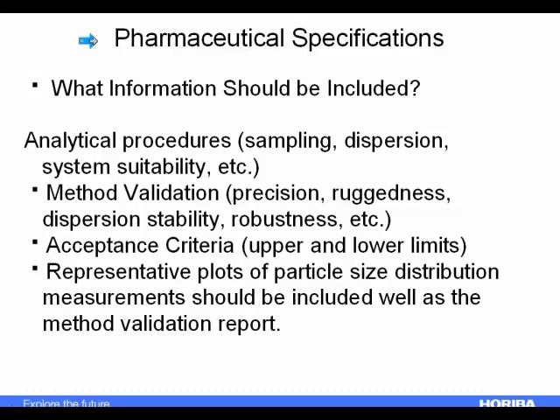So now let's get back to the actual specifications. Now, if we're in a regulated industry, what kind of things should be included in that specification? Certainly the procedure we used, the sampling, the dispersion, did I use ultrasound? Did I use a surfactant? In these industries, they actually have to worry about method validation. Separate discussion on that probably on our website, or perhaps Ian, one that you and I should do someday.